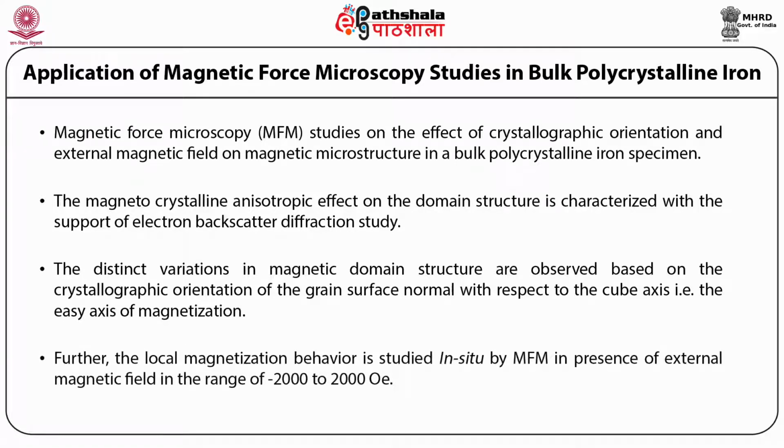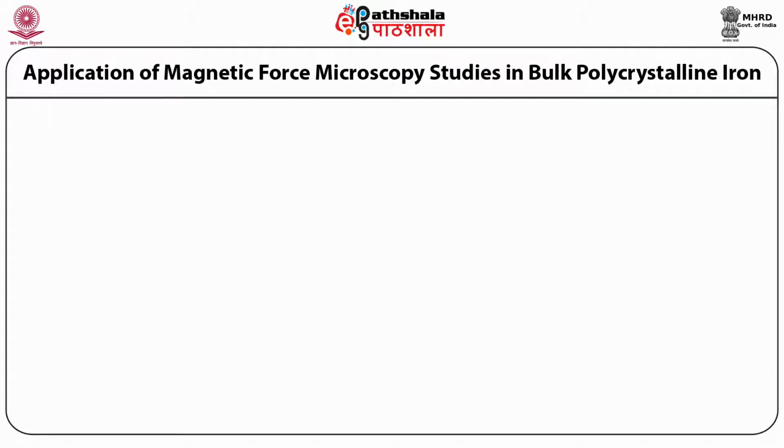Further, the local magnetization behavior is studied in situ by MFM in presence of external magnetic field in the range of -2000 to 2000 Oe.